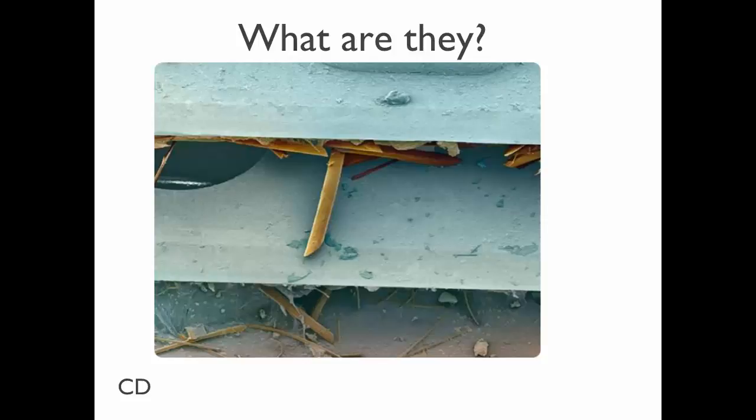It looks like something. Again, it's under the microscope. Any guesses? Cardboard? No. These little things are the hint. It's a razor blade. It's something you would shave with. These are hairs. These are the blades of the razor.